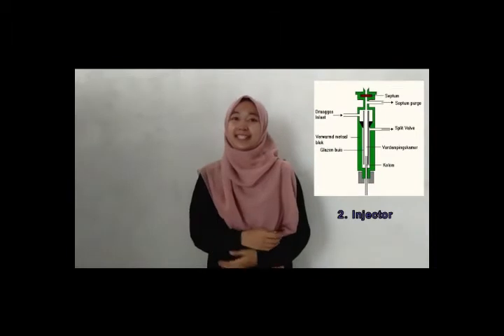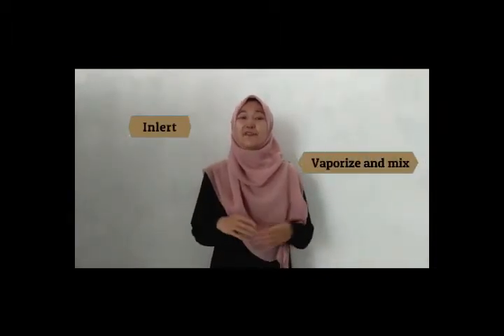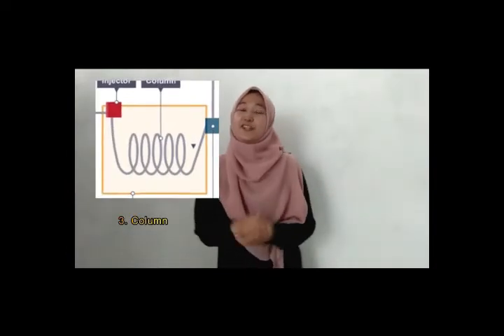Second is the injector. The injector is used as the inlet for the sample. The injector is also used to vaporize and mix the sample with the carrier gas before it enters the head of the column. Third is the column. The column is used to contain the stationary phase and as the passing way of the mobile phase. It is also the site where the separation of analytes occurs.